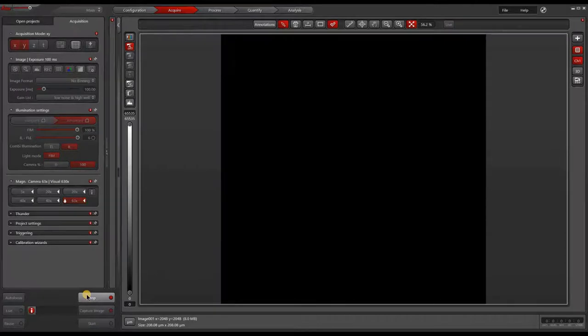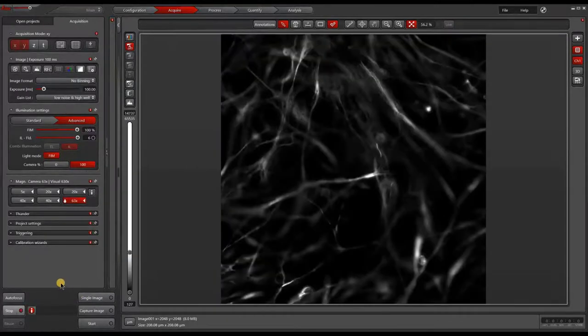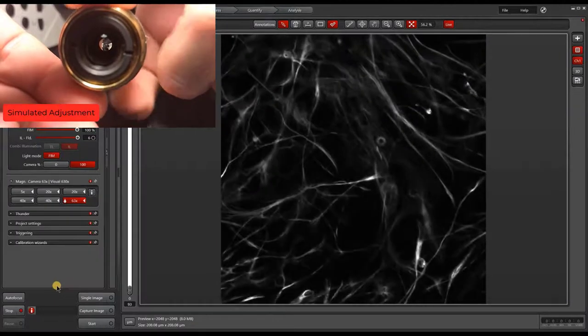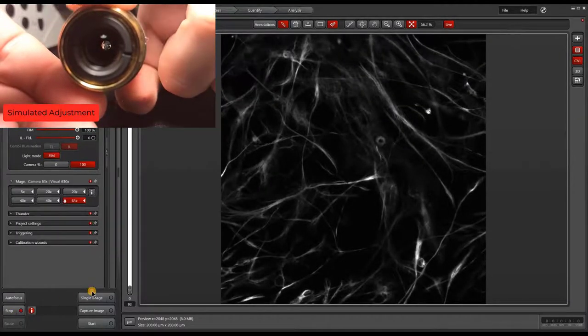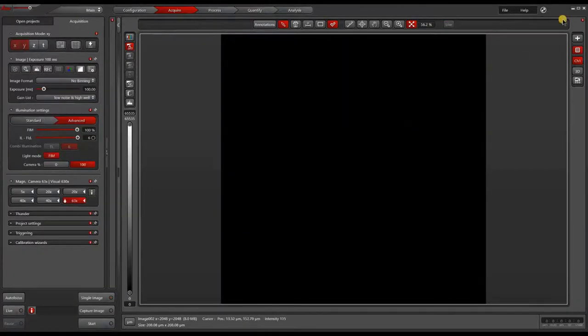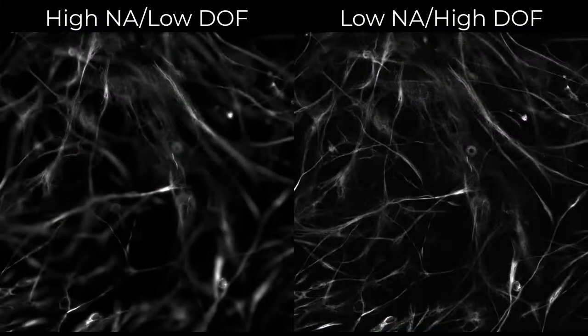With the iris open, we'll take an image for comparison. Now while live, we'll close the iris to lower the effective NA. After taking a second image, we can now compare the two images side by side. By decreasing the NA, we increase our depth of field but lower the resolution. You can see the image on the left has better resolution, while the image on the right has more in-focus features.